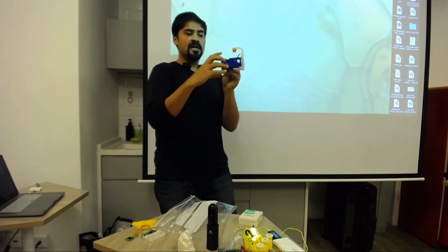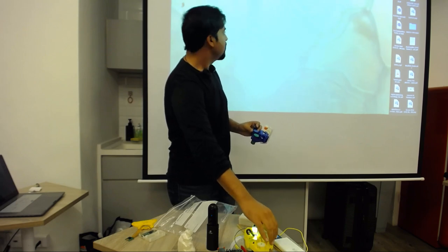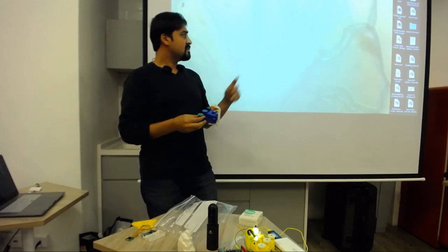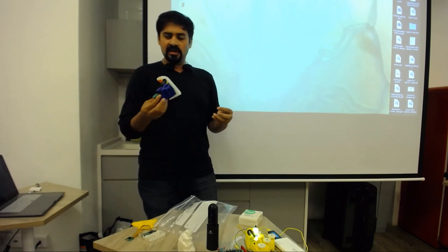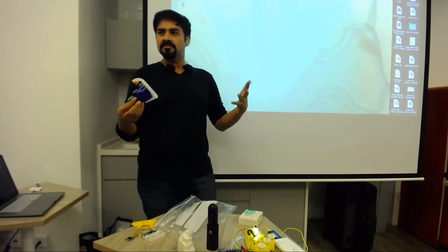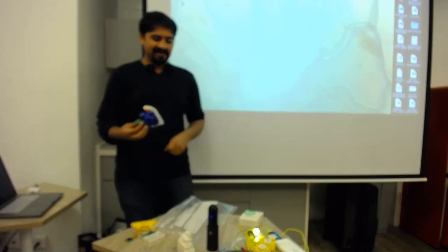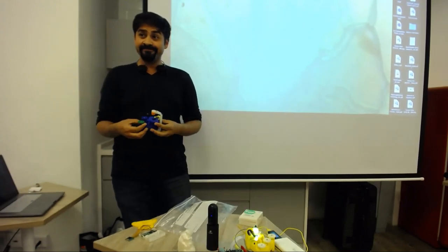You see that? And so that's what's happening. When you move the screw here, it's moving in one direction. This is left and right. Move the screw here, it's moving up and down. So you've got two axes of movement. And I've been told that this is surprisingly precise for something that came out of a freaking 3D printer. You normally use something that is like a proper lab scale microscope that you need to protect in the basement of an air-conditioned building, which requires wireless passes just to get into. But this you can have in any classroom. And if you break it, just 3D print another one.